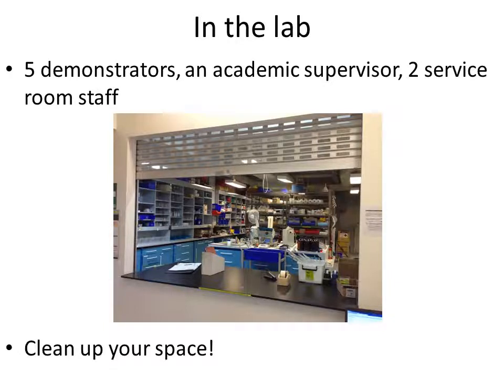You must clean up your lab space before you leave and leave it looking the same as when you came in. Students the next day will be using the same equipment and glassware as you, so you need to make sure that your things are as neat and tidy for the next lot of students. If you leave without cleaning up, you may be penalised 10% of your mark.